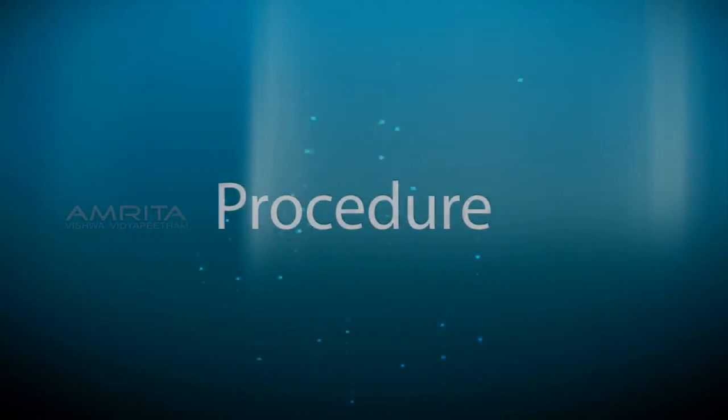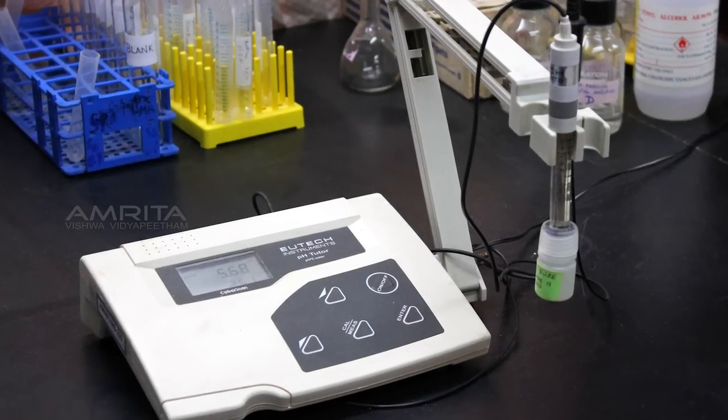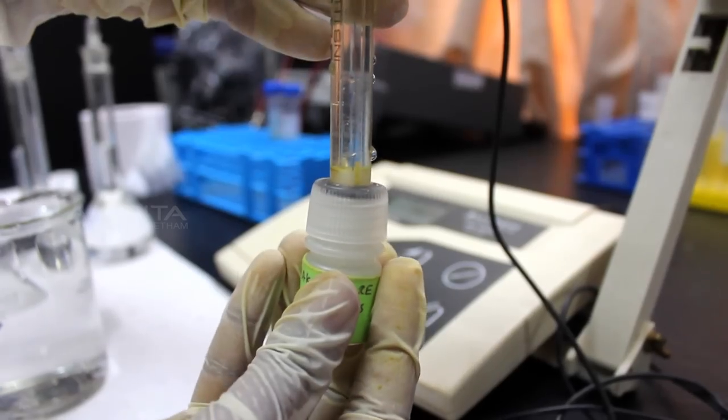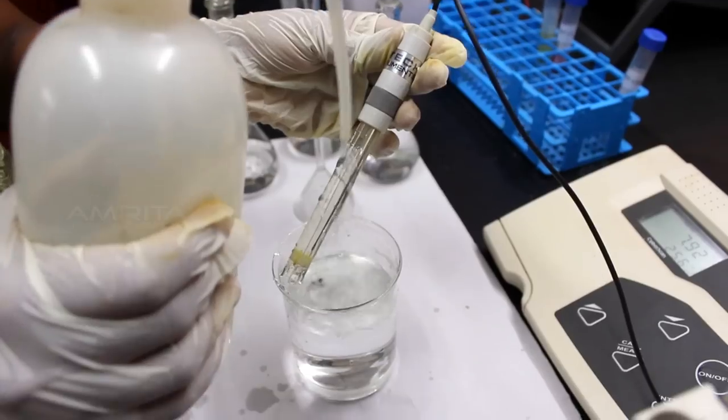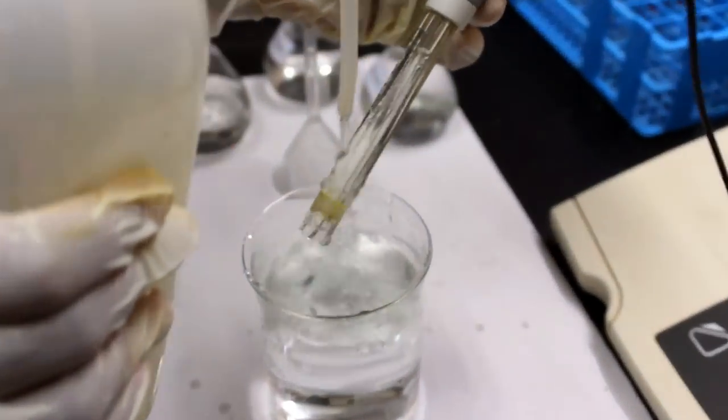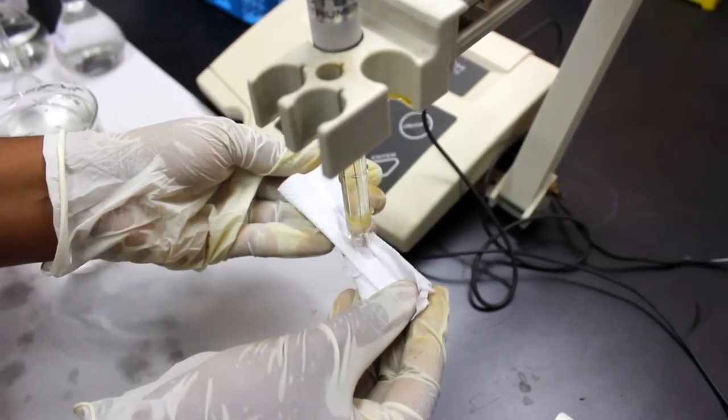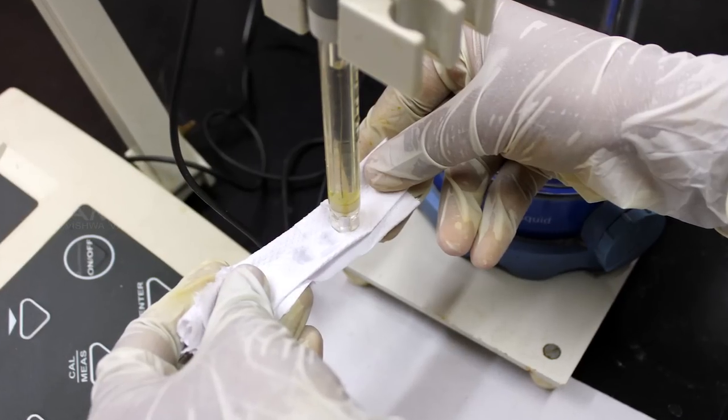Procedure: First calibrate the pH meter using the standard pH buffer solution. Remove the cap of the pH electrode and wash the electrode with distilled water. Now place the electrode back on the pH meter stand and wipe the bulb of the electrode using tissue paper to remove the excess water.